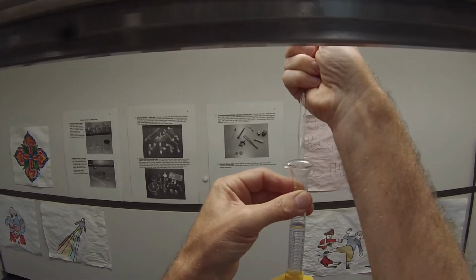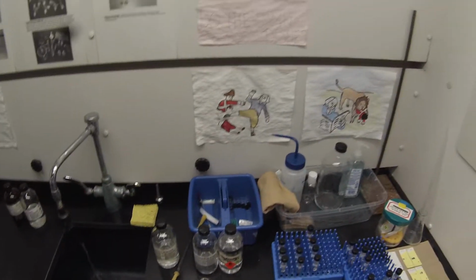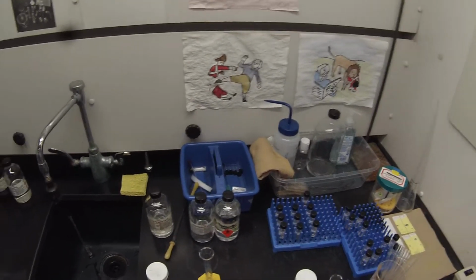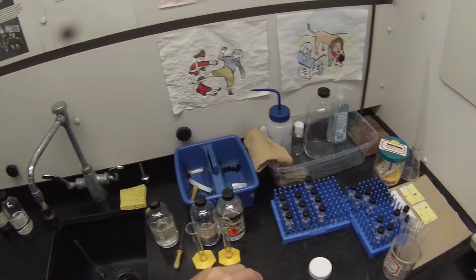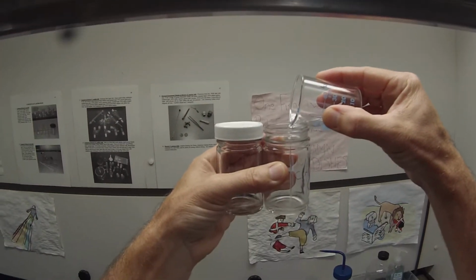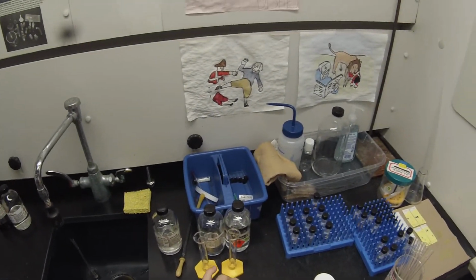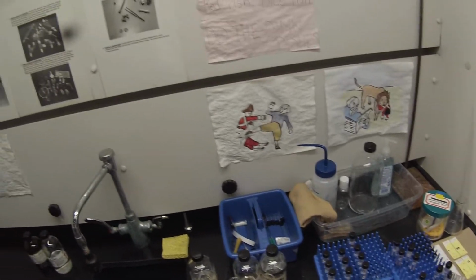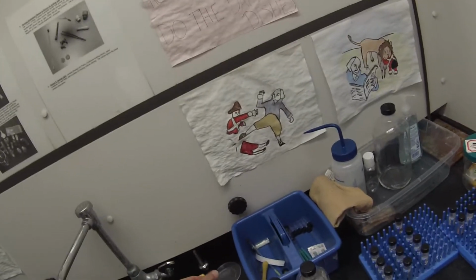And it's a little bit guesswork when you're first designing a TLC system. I want to make sure that's well mixed, so it's a uniform mixture. So I'm going to pour that into a 50 milliliter beaker and swirl that around. Make sure it's thoroughly mixed. And then I want about 4 milliliters, so I'll simply pour that in there until the volume in that chamber is a similar volume. And I can set that aside. Maybe I'll need it, maybe not. With a watch glass on top so that it minimizes the evaporation.